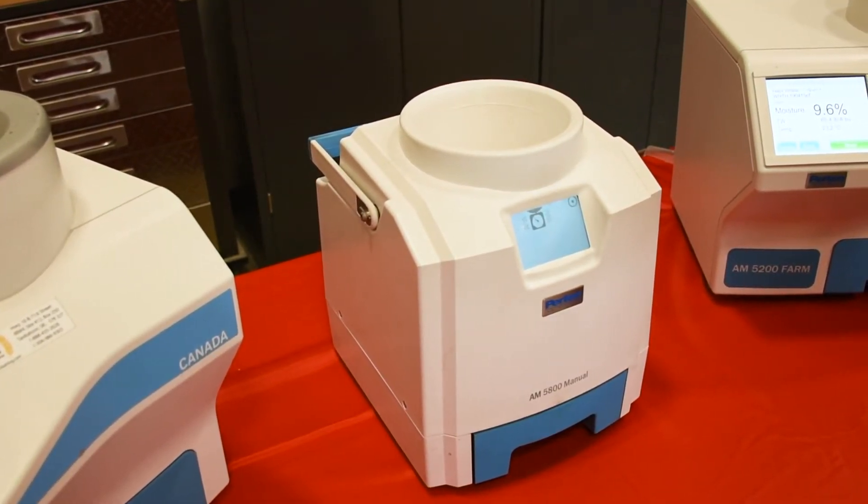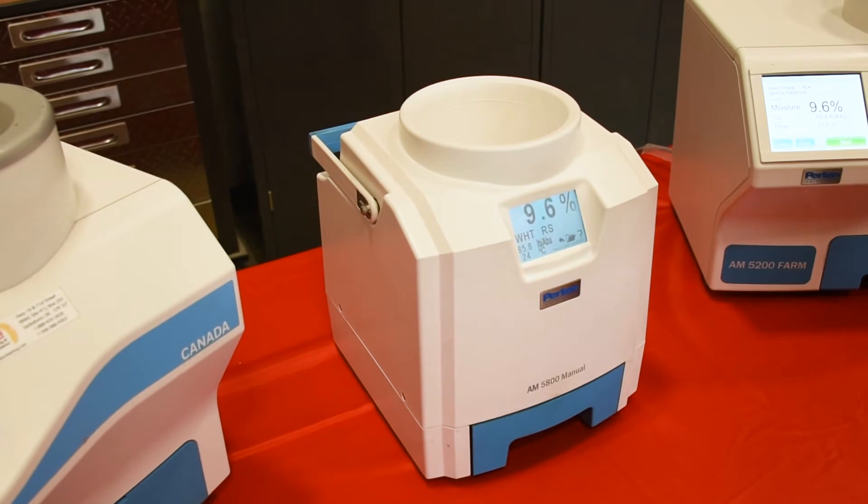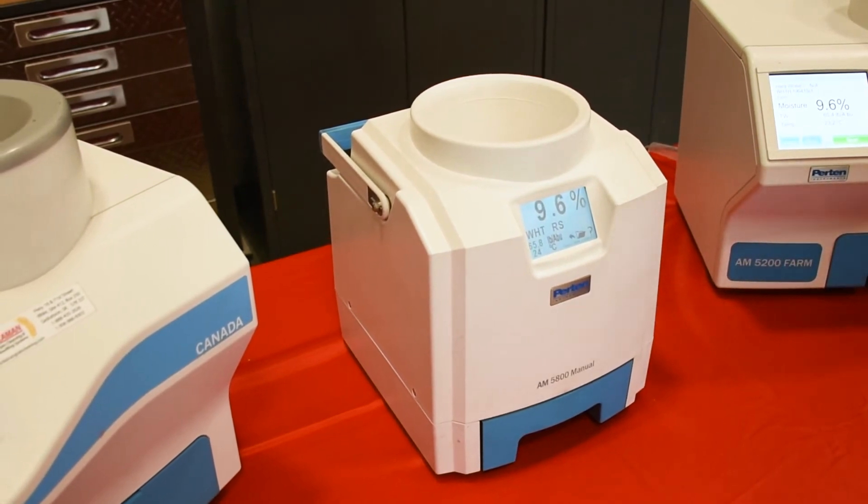This machine will display up to about 500 tests. Any kind of calibration changes or updates for the machine can be done through a free app that connects by Bluetooth.